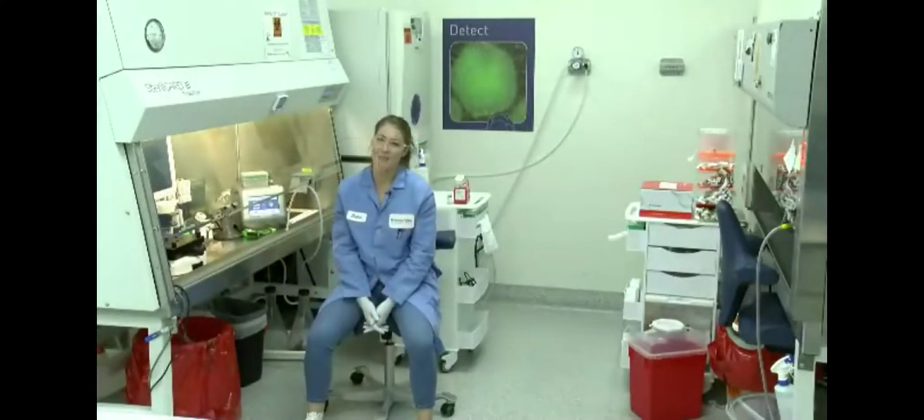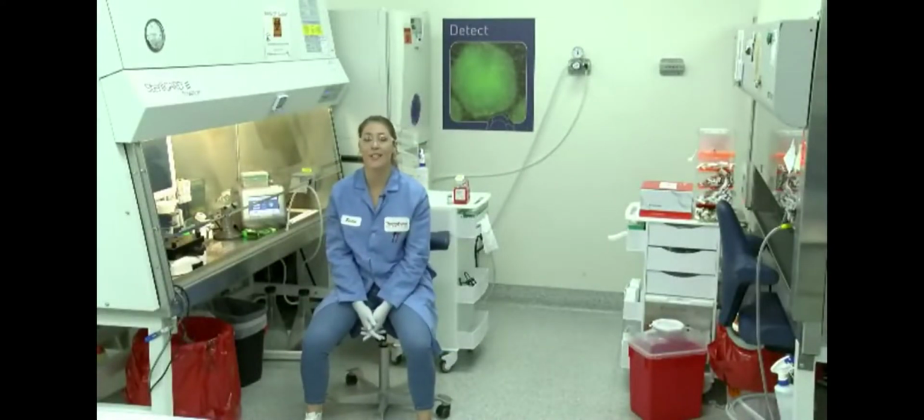Hi everyone, I'm Jackie and I'm here to show you electroporation using the Neon transfection system. Specifically, I will be transfecting induced pluripotent stem cells for CRISPR-Cas9 genome editing.